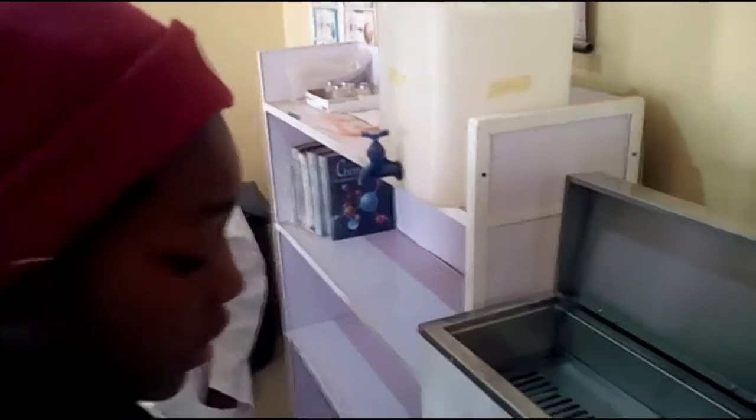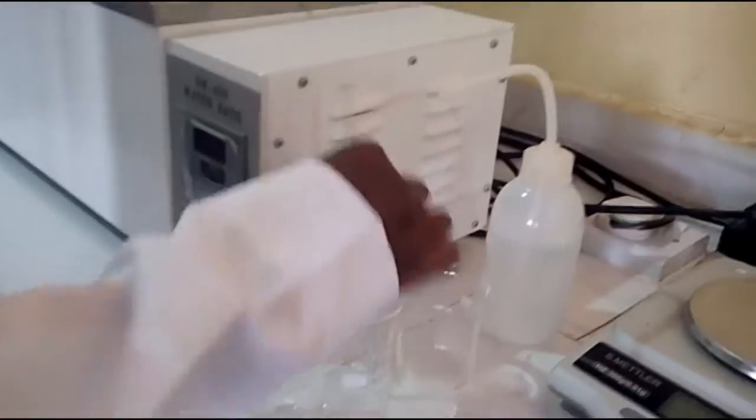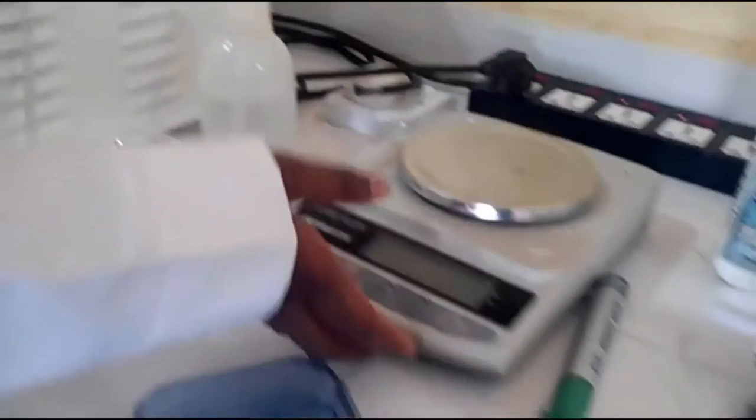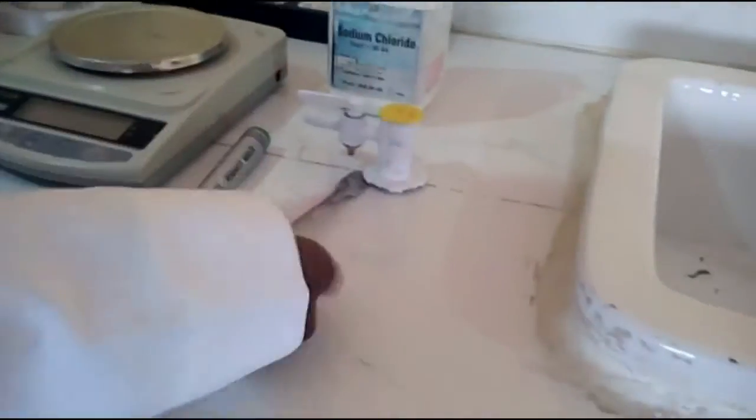And what are the materials needed for this practical? The materials needed are 1. Water bath, 2. Beaker, 3. Stirrer, 4. Distilled water, the weighing balance, a calculator, writing material, the spatula, and common salt.